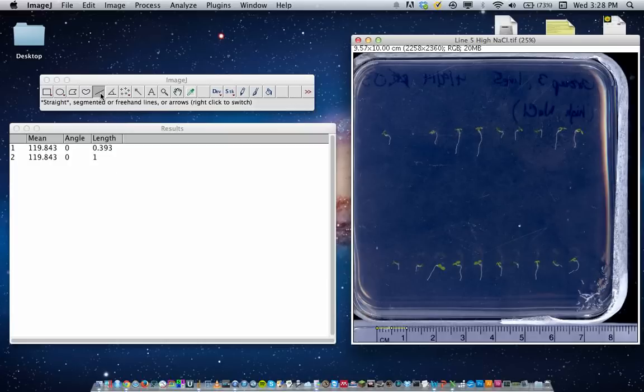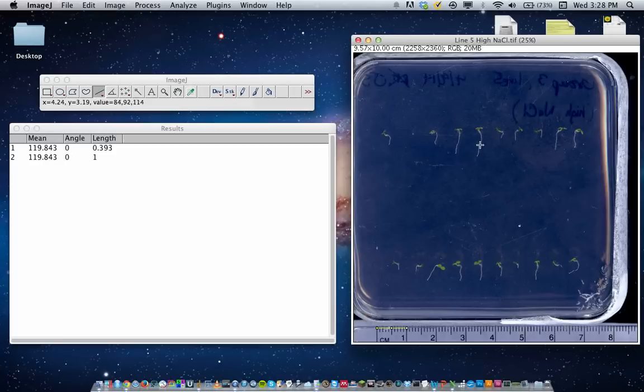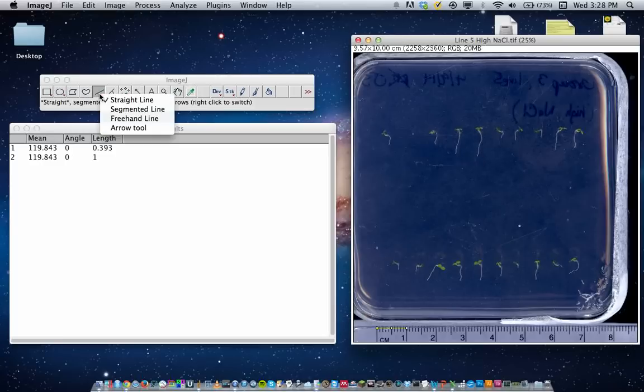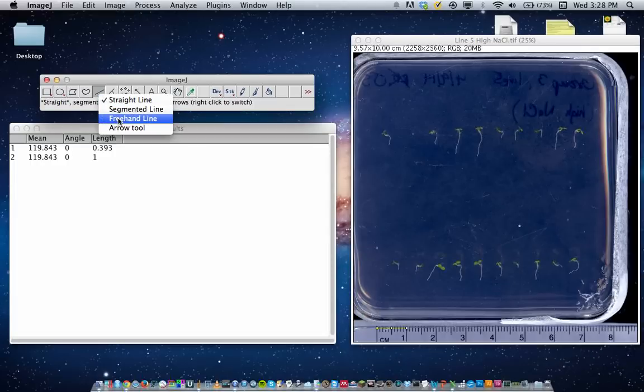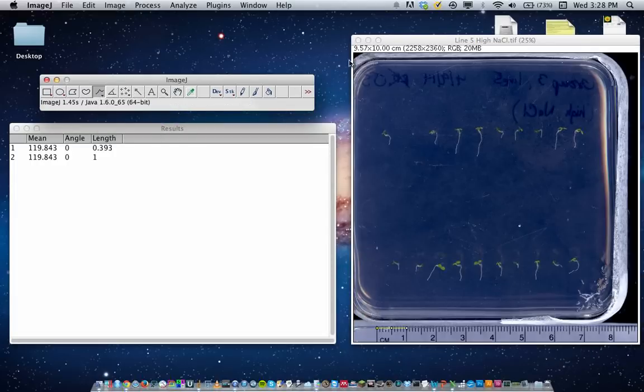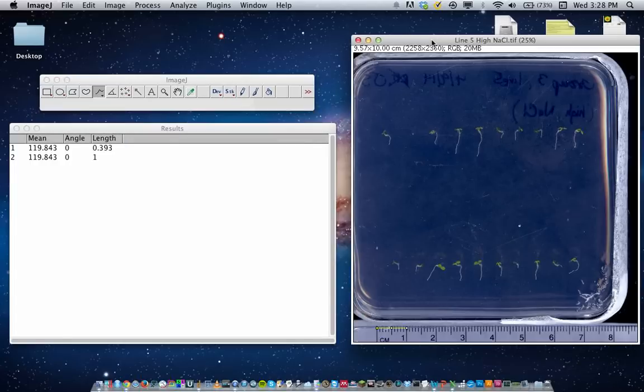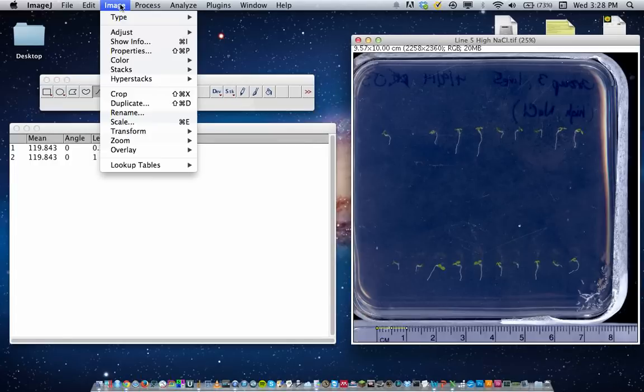Now, if I wanted to measure the length of this root or hypocotyl, I would recommend using the freehand tool. So you can go to the straight line segment, right-click, use the freehand line tool, and you can also zoom in the image to make it a little easier to work with.